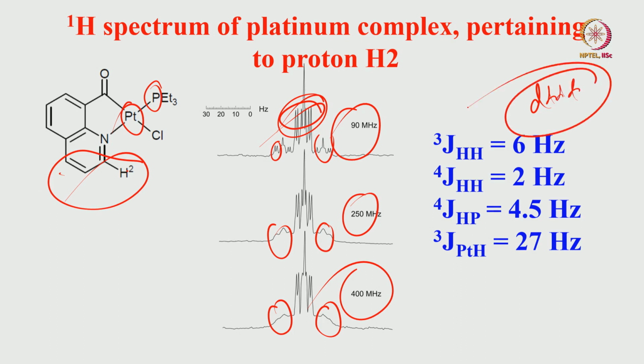So there should be 16 peaks, and if you carefully see, an identical pattern is on either side. That is because 8 peaks are here, and the remaining should be with the platinum. They come as a satellite. Okay, and that is seen here, the platinum proton coupling for this one, and the other couplings are seen here because they are abundant. Platinum coupling is appearing as a satellite here. You see an identical pattern, exactly like the pattern of the main peak.